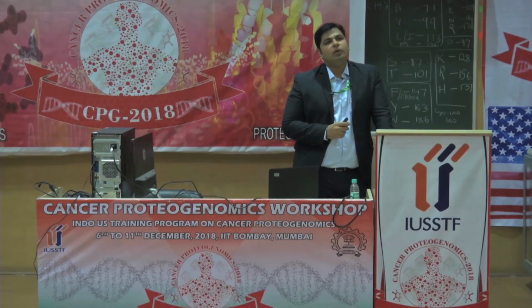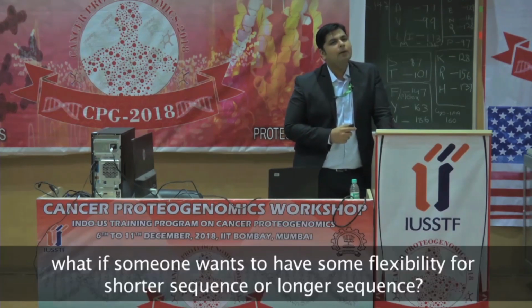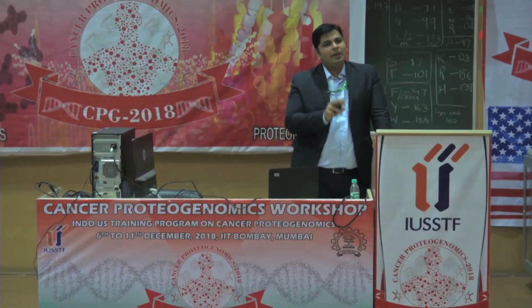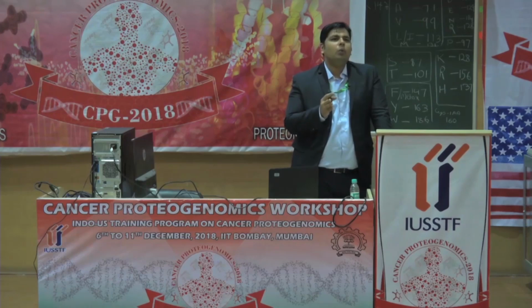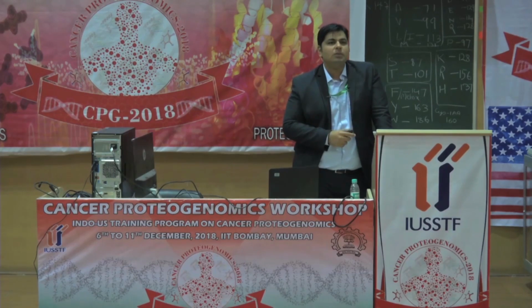Yes, the ideal limit we say is from 60 base pairs to 350 base pairs. So if you are thinking of multiplexing, you need to think of these amplicons, and the window is quite small, but you can actually manipulate it. As I told, what is recommended is 60 to 350 base pairs, like for real time PCR as well. But we have people who have amplified and specifically quantified up to 2 kb fragments as well.